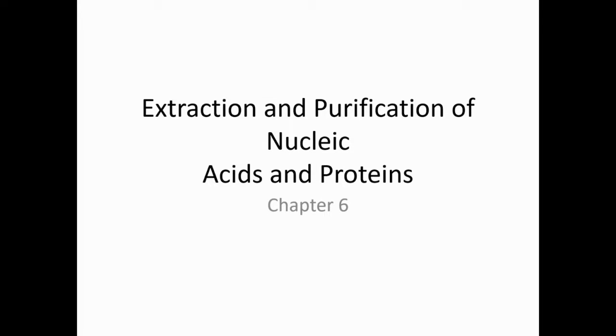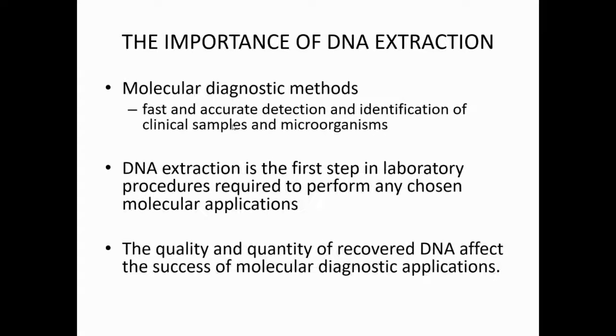Okay, so as I said, today we will discuss the extraction, purification, and the analysis of nucleic acids. So that'll cover half of chapter 6 and the whole chapter 7. Okay, and then the first one that we want to discuss is the extraction of the DNA.